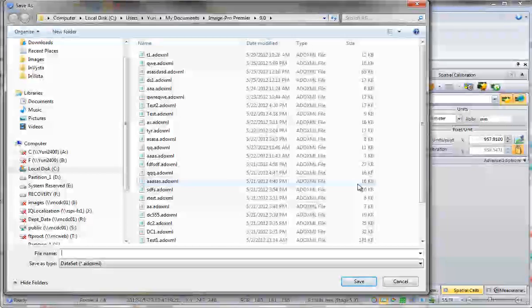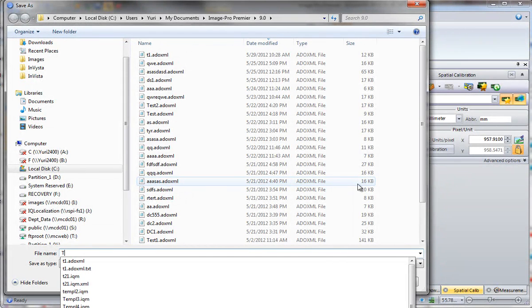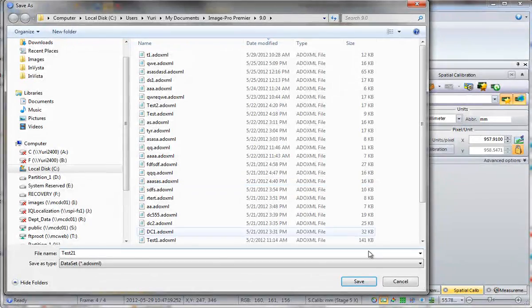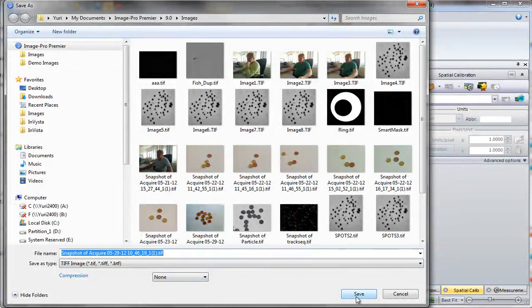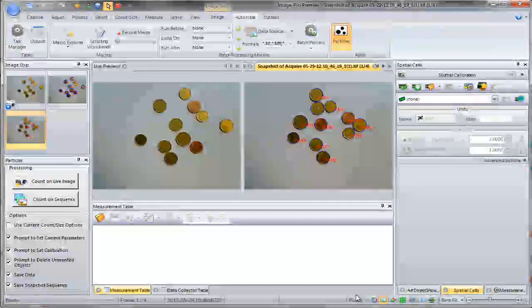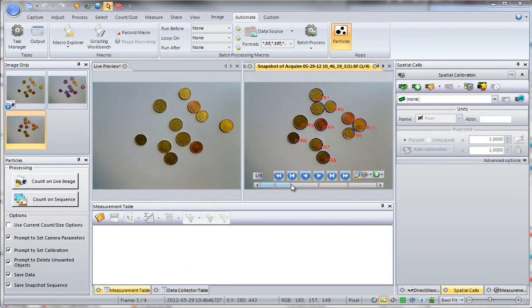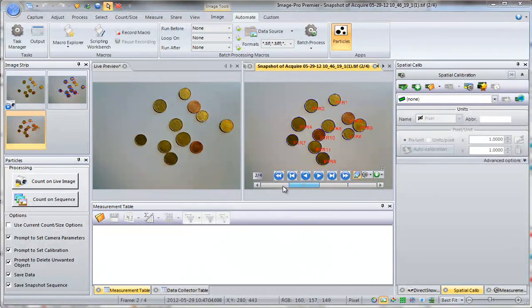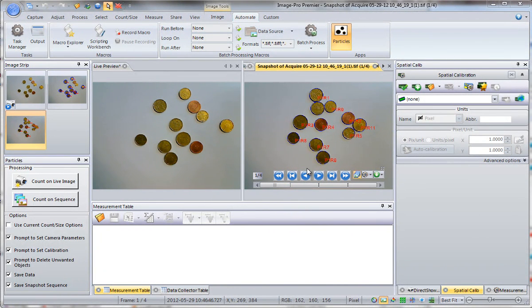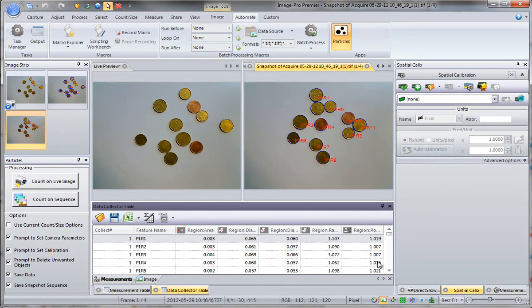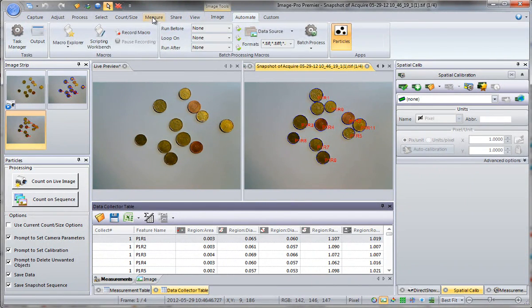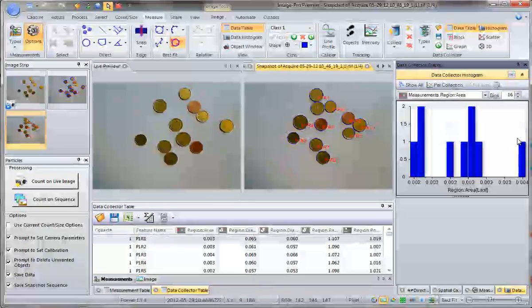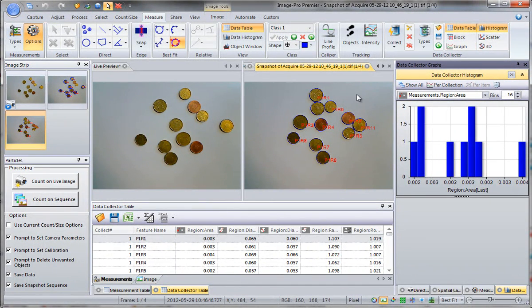You will be prompted to save data to a file. A snapshot sequence of the captured images with overlays will also be saved. This snapshot sequence contains overlays of every object so you can see how they are created. Data collector contains data for every object, so you can look at it either by image or by measurement.